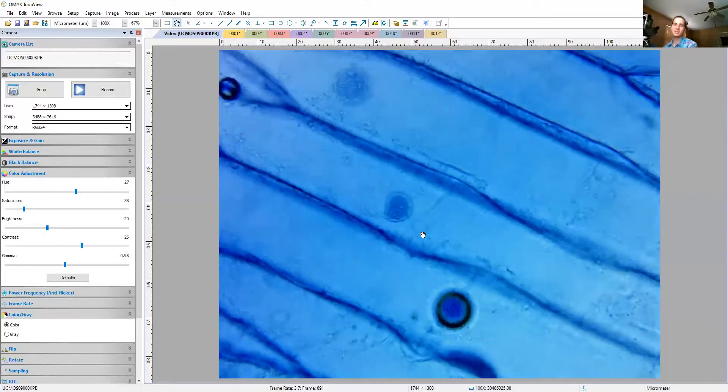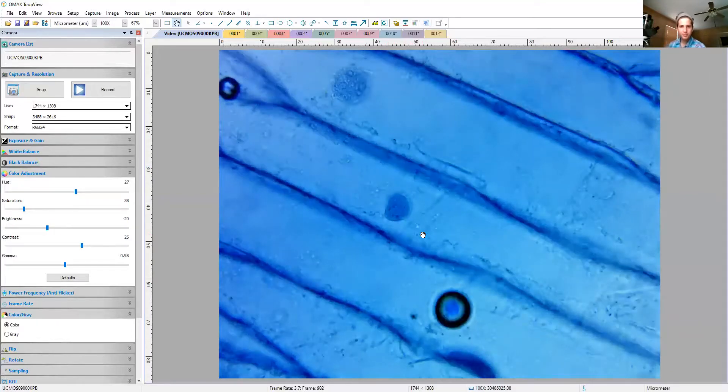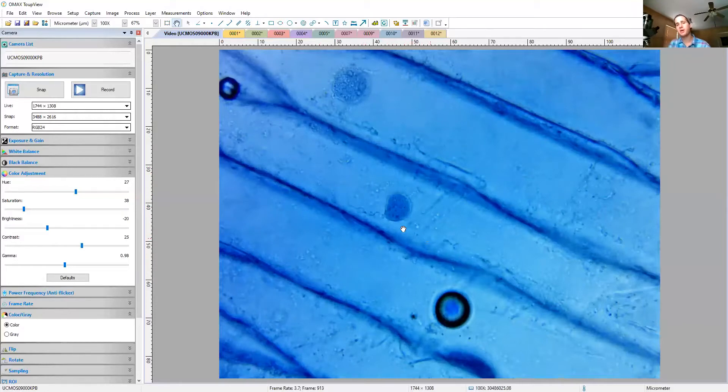They're going to be on the inside of each of those cells, around the inside of each of those cells. And lastly, the only feature we haven't discussed yet, all of this empty space surrounding our nucleus is going to be cytoplasm.